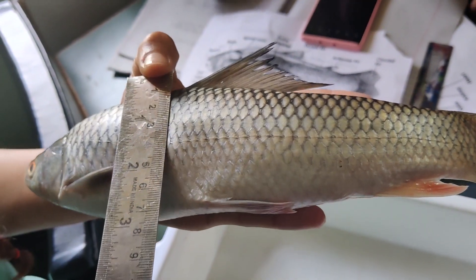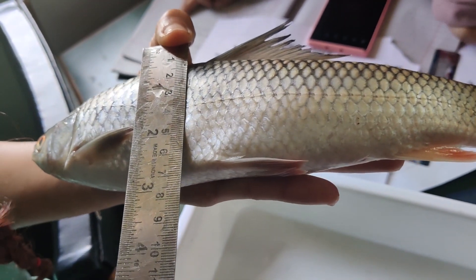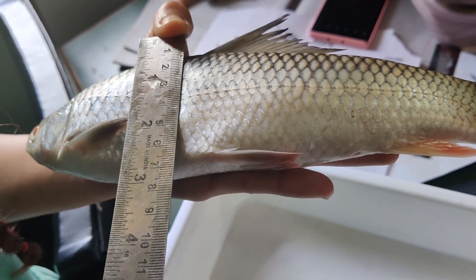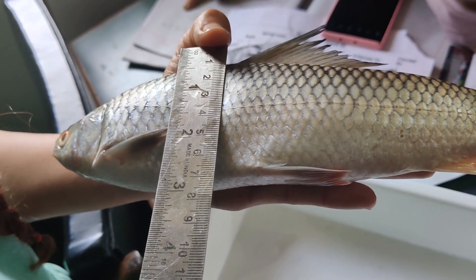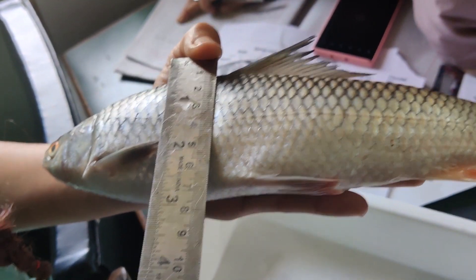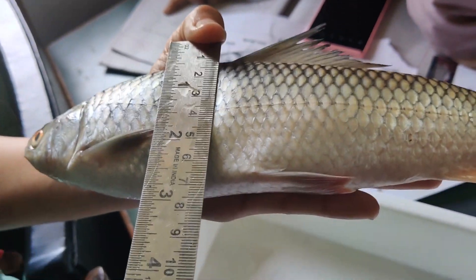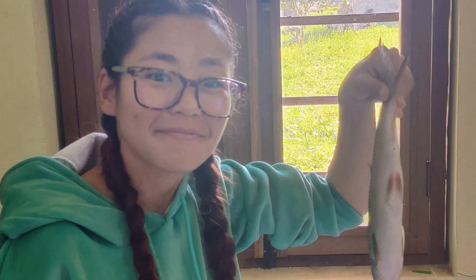Body depth — what is the thickest region of the fish? The thickest region of the fish. The body depth is 6.5. This is the morphology of the fish.